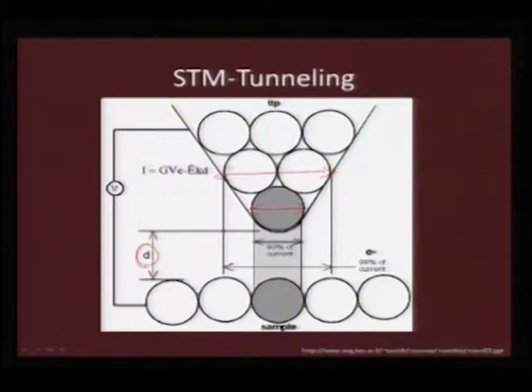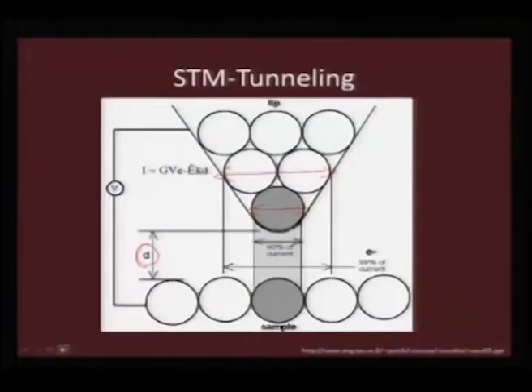So, your probe has to be very sharp and very well defined, otherwise tunneling cannot be exercised if your tip is not properly prepared. Therefore, in STM technology, tip preparation itself is a costly procedure, and if you understand the chemistry of the tip preparation, you will see that it is a simple electrochemical technique that can bring about great results. We will see that shortly from now.